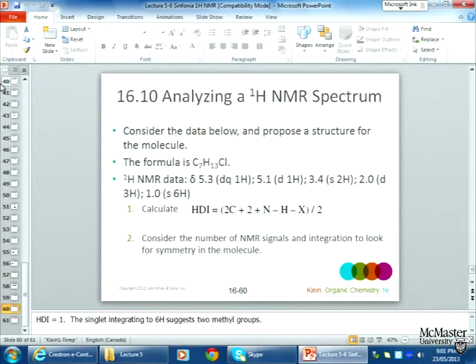So that is the doublet part of the doublet of quartets. 1 neighbor. How many neighbors do we have to get the quartet part now? 3, right? So what has to be attached on here? A methyl group, right?